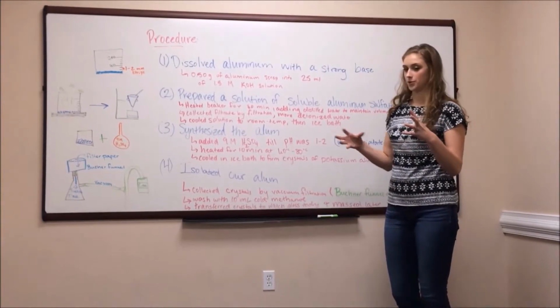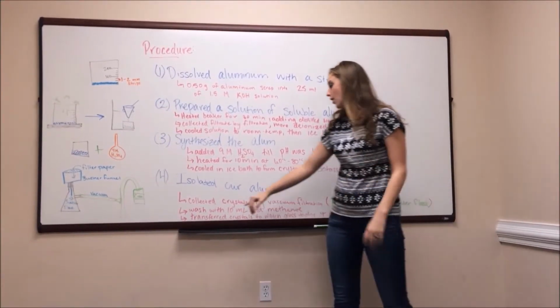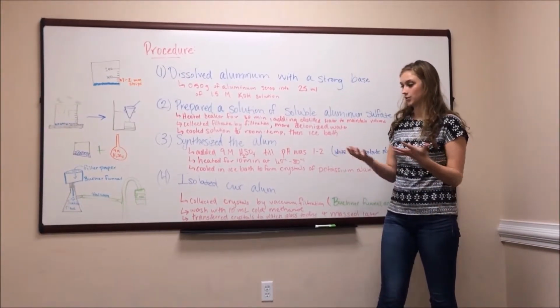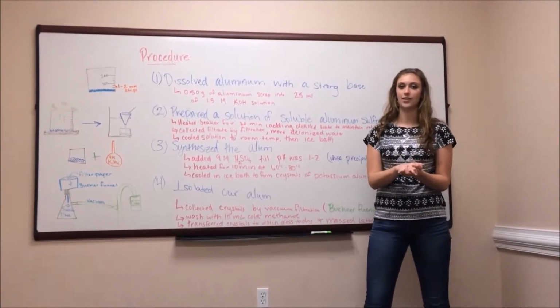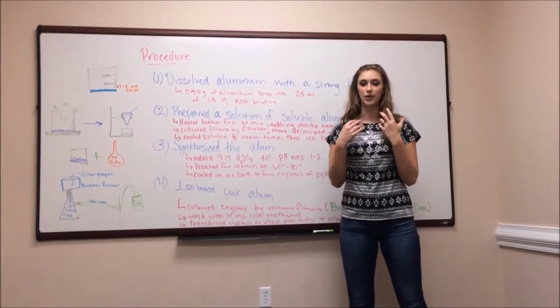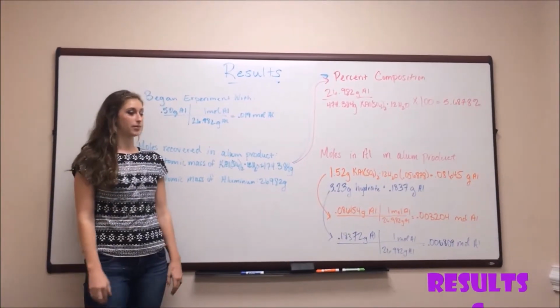And in order to just have the hydrated crystals, we had to wash it with 10 milliliters of cold methanol. And then in order to just have our crystals without any water left on them, we had to transfer the crystals onto a watch glass and let them dry overnight. And after all that was over, we weighed what crystals we had left. Now on to our results of the experiment.